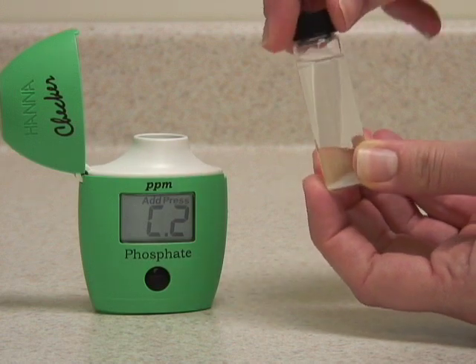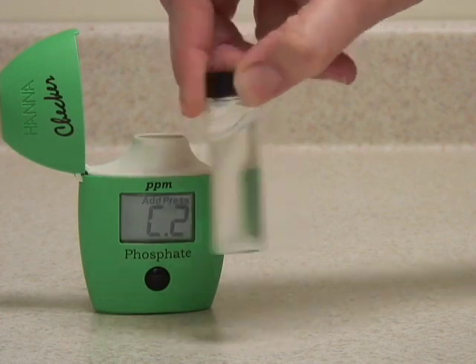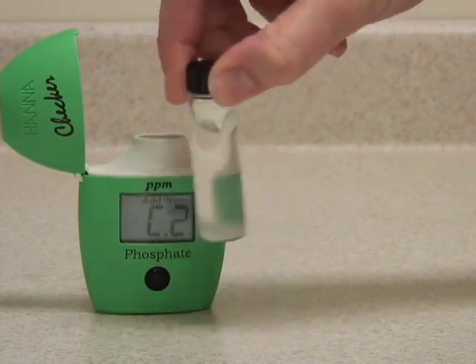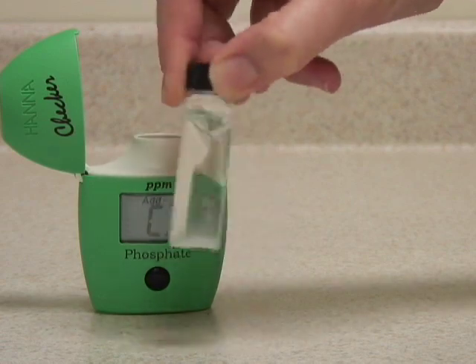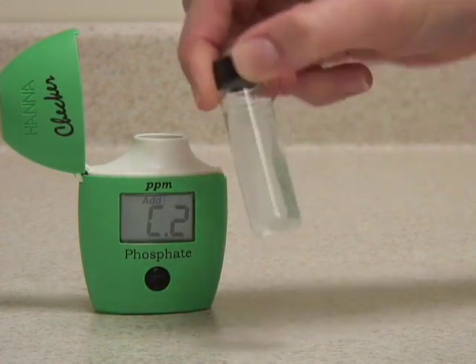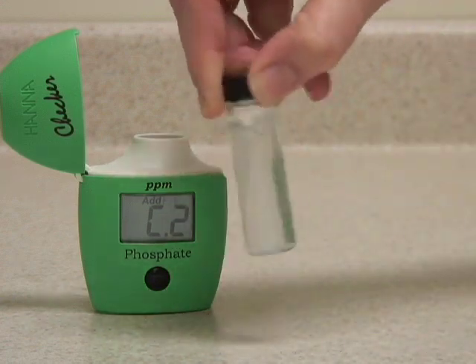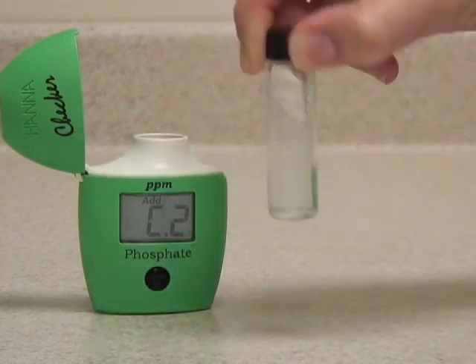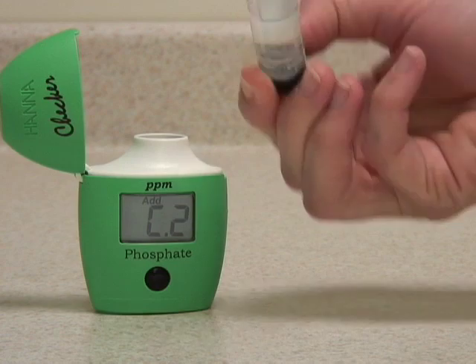Put the cap back on and shake gently to dissolve the sample. Try to avoid shaking it too vigorously, as that can introduce micro-bubbles that will alter your reading. The best way is to swirl the vial gently or invert it until the sample is mostly dissolved.